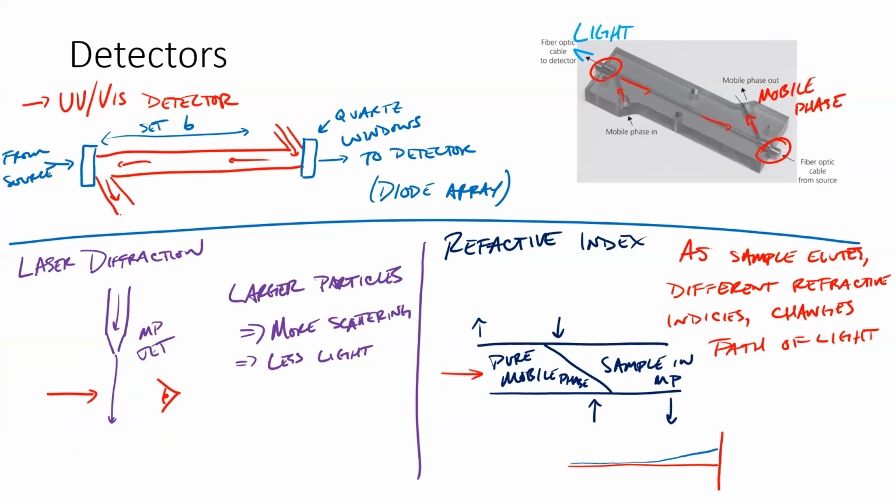At that interface, you're going to see the difference in the refractive index show up because now I've got these two different refractive indices that causes more refraction. That changes the path of the light through the second material, right? This is for particularly viscous stuff, right? I mean, you have to have non-negligible changes in refractive index in order for this to be useful.